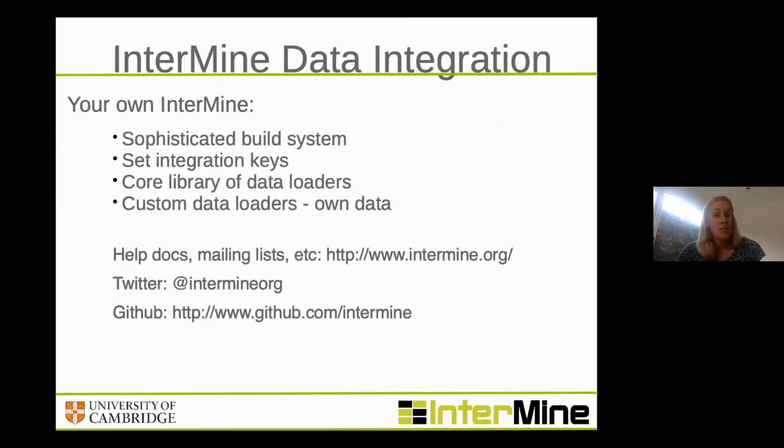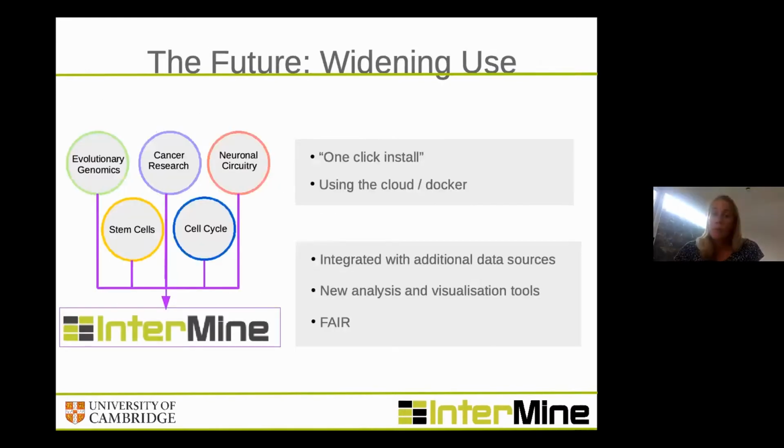Okay, so you can build your own InterMine, but we're not going to cover that at all on this workshop. At the moment, it takes some computer expertise to build your own InterMine, but there's an awful lot of information available on the InterMine website, and a lot of help available, mailing lists and help pages, if that's something that you're interested in doing. But we also currently have a grant in progress, which is making InterMine available to the lab researcher.